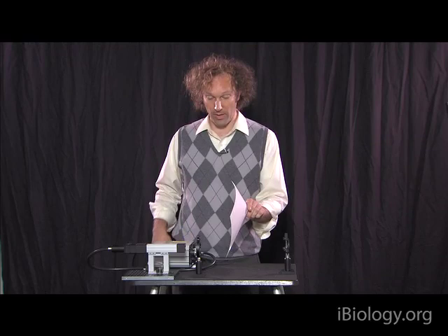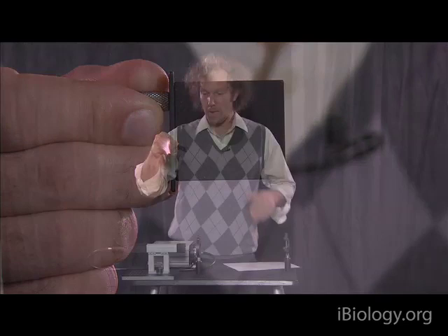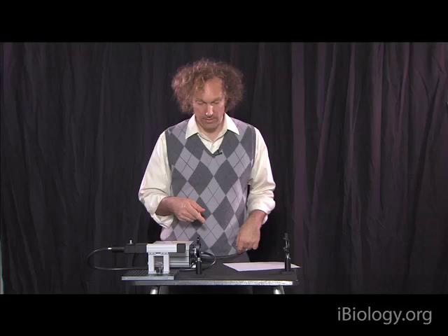Now, just converging the rays to a focus is a good start, but really we want to converge rays to a focus from an object of interest, from a sample. So let's add one more thing to this system, and that is a tiny little cross. This is an opaque surface of glass that has a small, thin cross that allows light through. If we put this object at the focus of the lens, it's being illuminated by this light, and it's now at the focus of one lens.